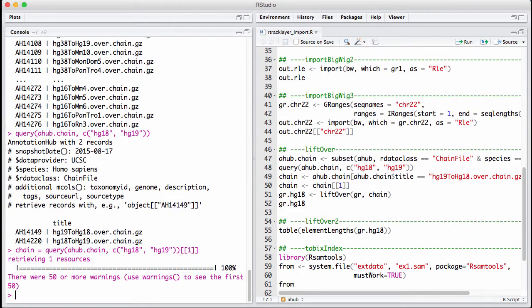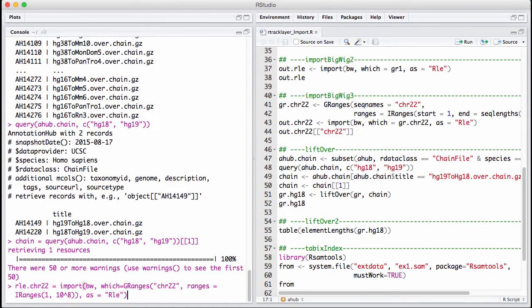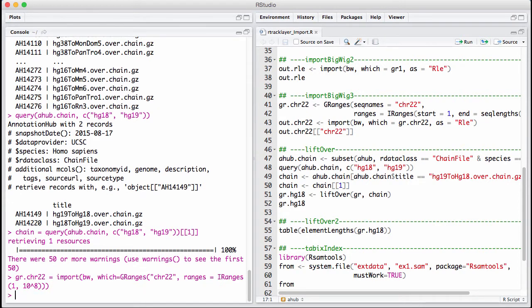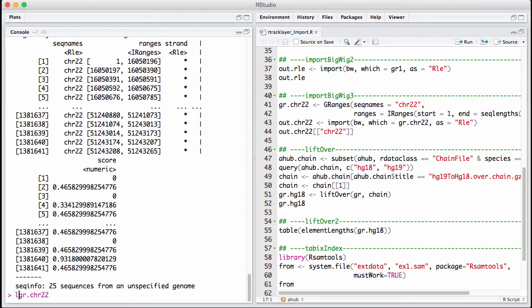All I need now is a set of GRanges. Let us just use what we got out of the BigWig before. Let's read it in here. Make sure we have a GRanges. So we have gr.chromosome22. We want to convert this from hg19 to hg18. Just say liftOver and then we give it the chain.